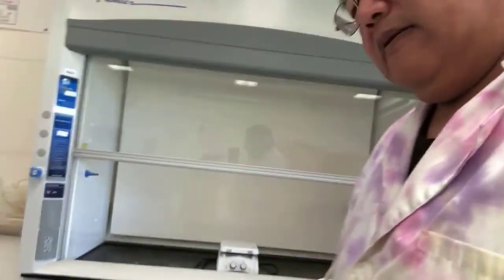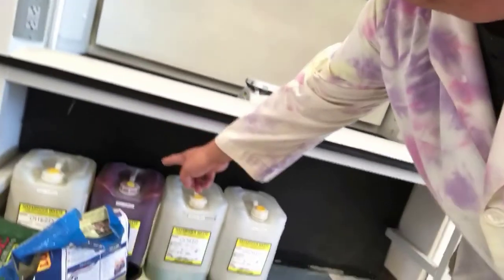So a couple other things about when we do labs. We need to dispose of the chemicals that we use correctly. For that, we have these waste bottles that are down underneath the hood. When you're doing an experiment and you've generated waste, typically we'll collect that in a beaker. Oftentimes you'll collect it in a beaker at your desk, and then you'll come to the hood.